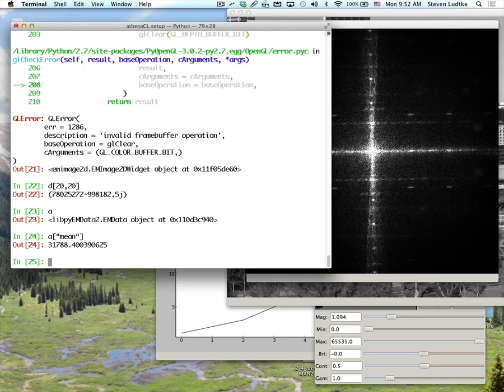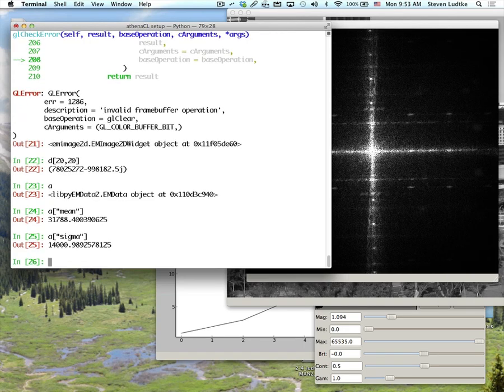It can act sort of like an array of arrays, like a matrix, if I pass in tuples of numbers, or if I give it a string, it can act sort of like a dictionary, and it will return values associated with things. Some of these attributes, like the mean or the standard deviation, are automatically calculated for the image. Other values are stored in the file on disk and read with the file when you read the file in.